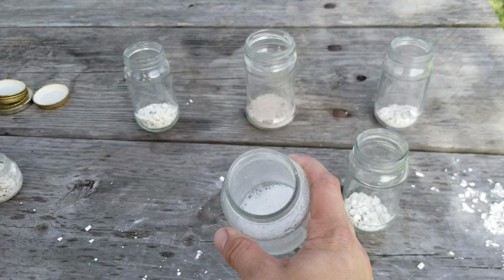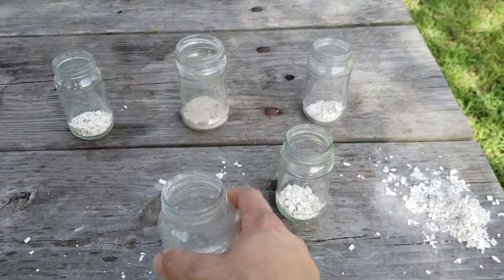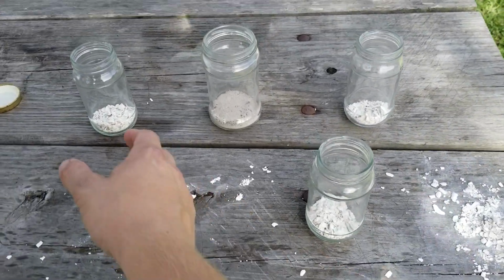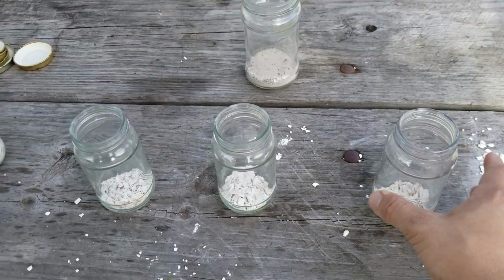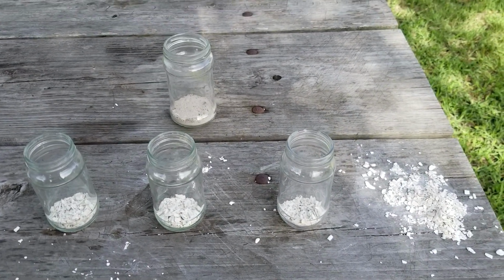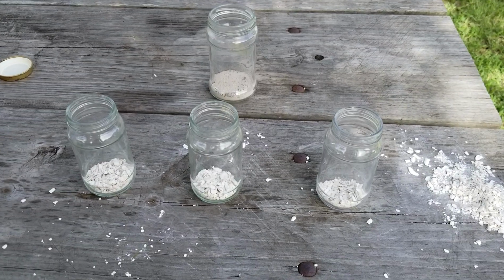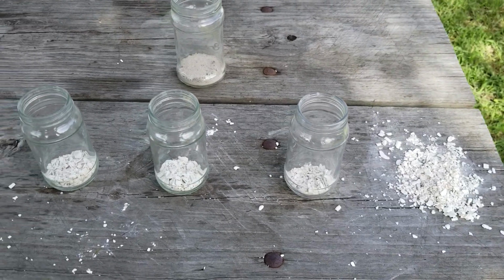We've all seen this reaction before with baking soda and vinegar volcano. It's a very overdone experiment. But other carbonates will do it as well. And here I have calcium carbonate. If you have hard water, you are probably familiar with this, as it is not very soluble and it will come out everywhere. It will fill your pipes, it will form hard water stains on sinks and toilets, etc. It just crashes out of solution everywhere. It's just not soluble at all.